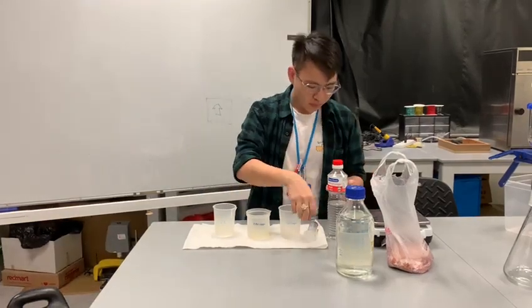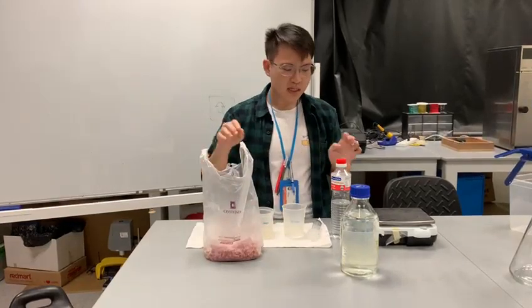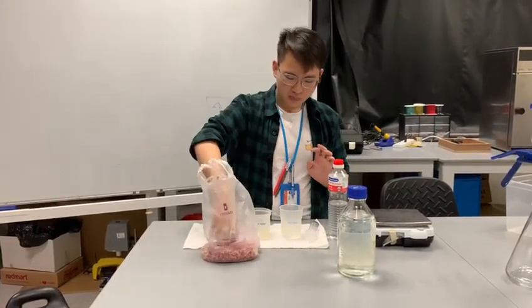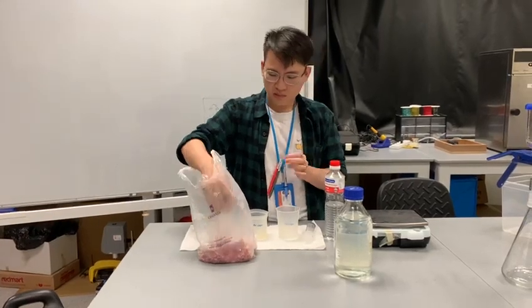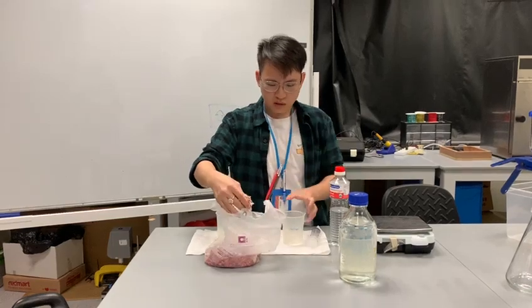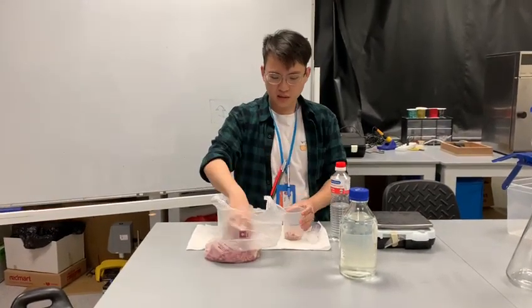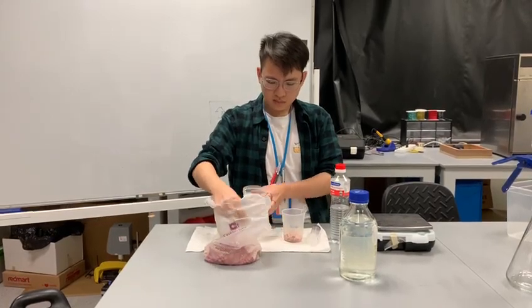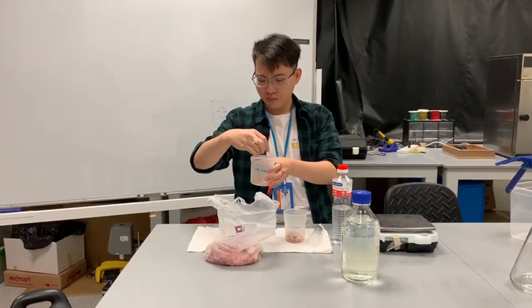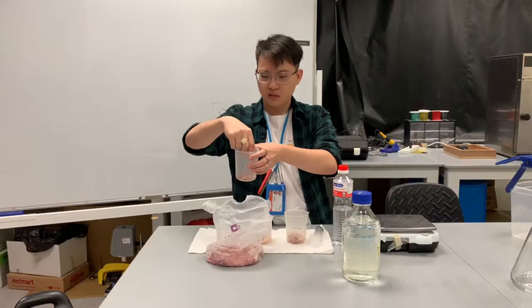So what we will be doing in this experiment is standardizing the volume of the liquid used. Let's just grab a bunch of eggshells, and we'll put them inside each of these containers. These eggshells have been crushed before this. We'll just grab a bunch.